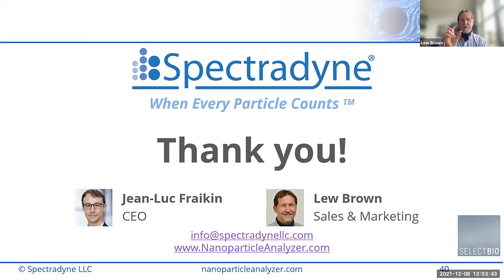But in our system, when I measured these particular cylindrical viruses, they showed me electron microscope images of the particles themselves. And I was able to say, okay, if we use the formula for a cylinder, the volume of that particle will be X. And then I back calculated what the diameter of an equivalent sphere is. And I said, those will show up at 100 nanometers. And when I measured them, they showed up right at 100 nanometers. And that really proves that we're measuring the volume, not assuming it's a sphere and making it a sphere.